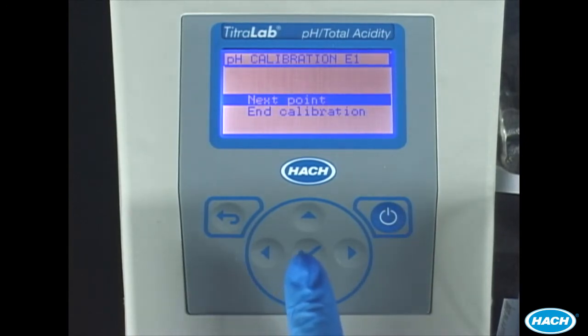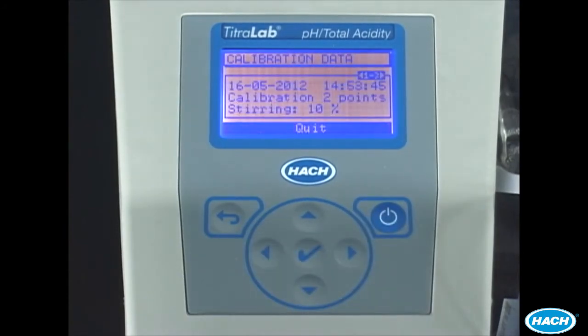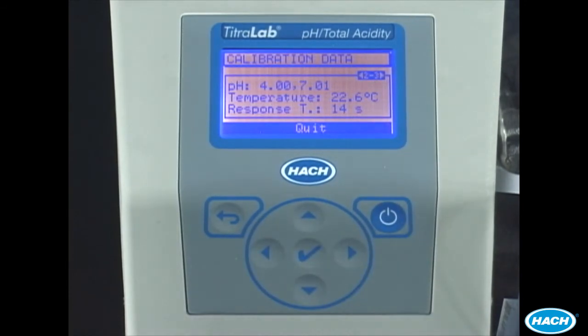Following successful calibration, select End Calibration and press the check mark to finish the calibration. The results of the calibration are stored and you can use the right arrow key to see the results of the calibration. Press the check mark to quit the calibration.